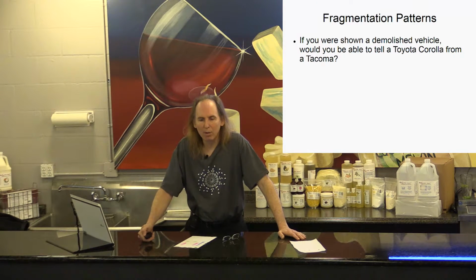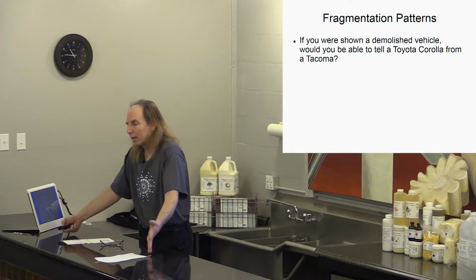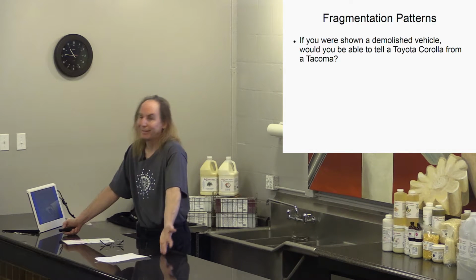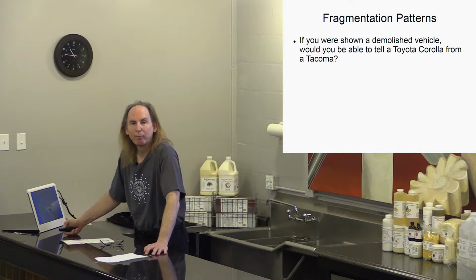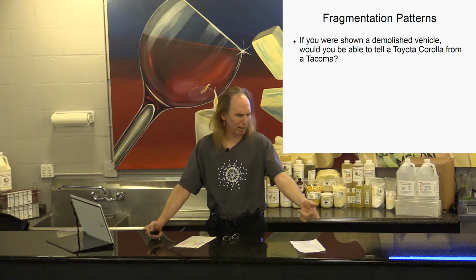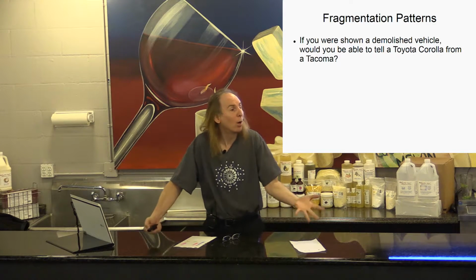Imagine, though, that you notice that in amongst the pile of car parts was a tailgate. Can you identify it now? Yeah, that's probably okay. I can probably say, okay, that's a tailgate. It's got to be a pickup truck because a Corolla doesn't have a tailgate. Now, you might also look, oh, there's the Toyota logo, and look here, it says Corolla right on it. But the molecule doesn't have that. All it has is the weight.